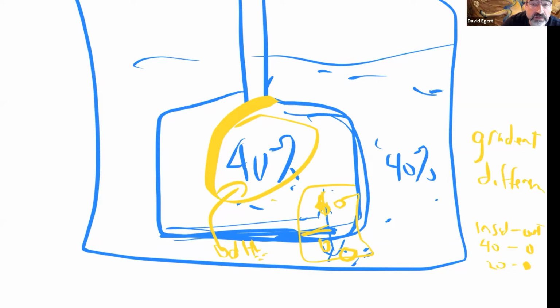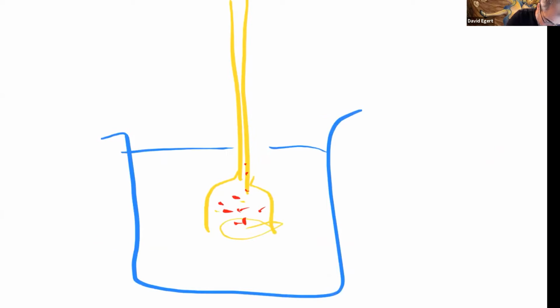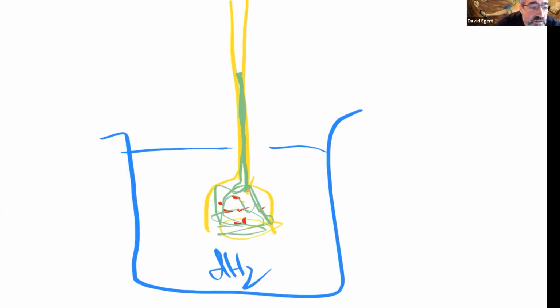So does that make sense? So if I set this thing up, I have some kind of stuff in here, and I put it in my distilled water. And let's say I start seeing the fluid run up. How do I know that sugar can't cross the membrane if I see this happening like this? Do I know for sure that sugar can't cross the membrane?